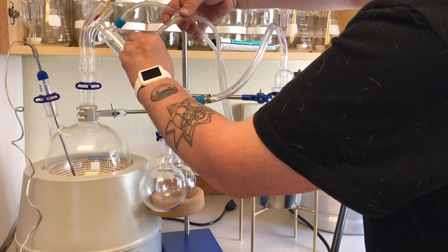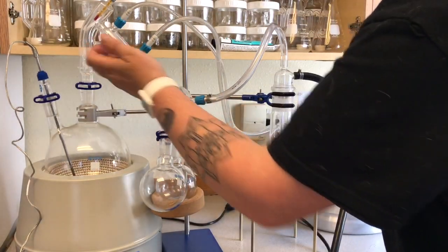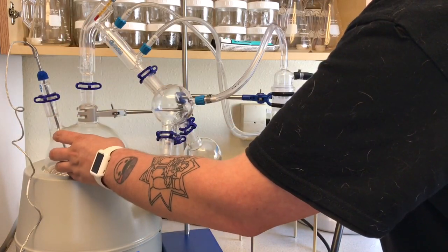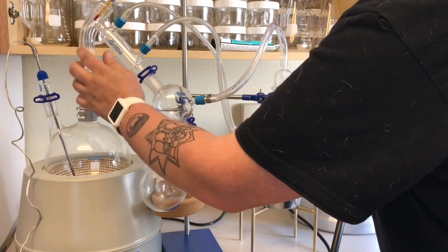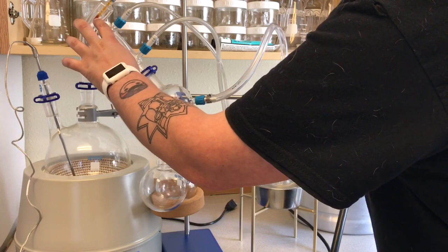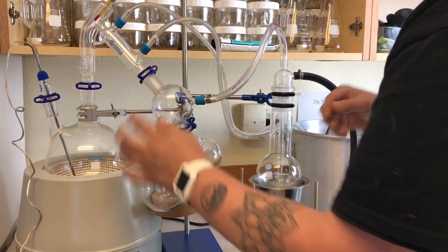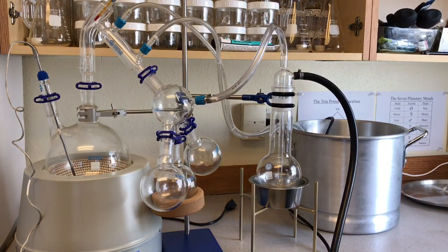Distillation, that's the proper setup. You don't need to reef on these, and it's okay if you get a little air bubbles, because again, all we're doing here is cooling. Our material is going to come up through the distillation apparatus as a steam, and once it reaches the top, this cold chamber is going to cool it back into a liquid, and we'll be able to separate it into different classes or different molecules based on their temperatures at which they evaporate or boil.